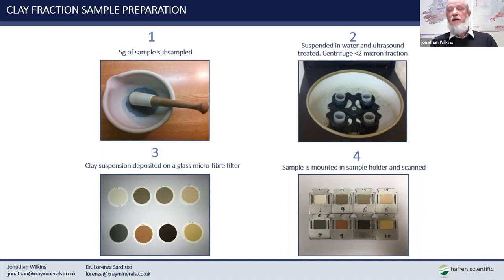And 2 microns, depending on your particular orientation, is the definition of what makes a clay material. And of course, this 2 micron dimension is determined by the Stokes equation for the settling of uniform media. It's more complicated than that because they aren't really 2 microns, but they are the equivalent, given that, as I said earlier, these are flattened morphology particles, which will settle much slower.